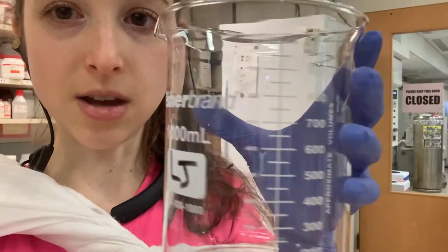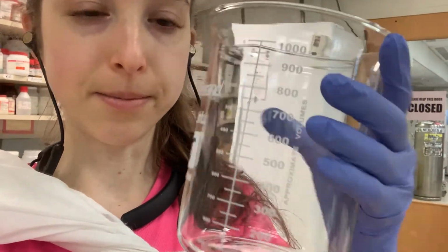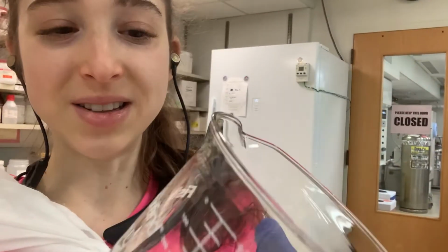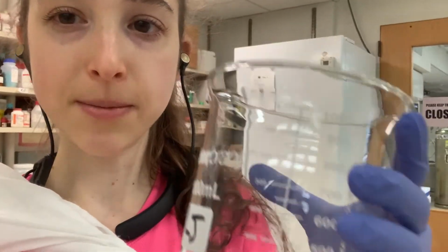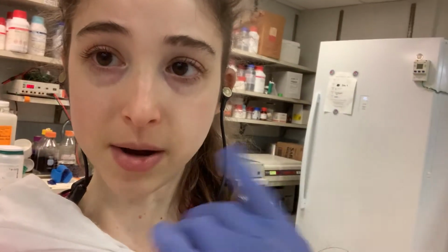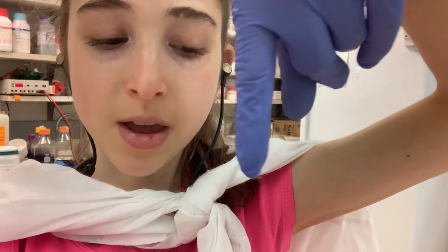Remember that the markers on these beakers are only approximate, so you don't want to rely on them, but they can be helpful for this part because you just want to make sure you leave enough room to adjust. You can adjust with the pH probe. You want the probe in there and you want it to be mixing while you're doing this, so the magnetic stir bar on the bottom is mixing the liquid as it goes, and you have your probe in there.